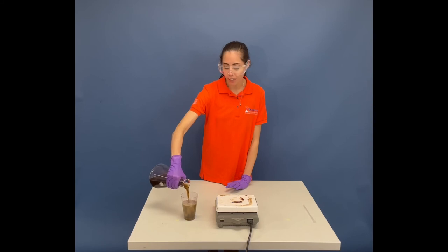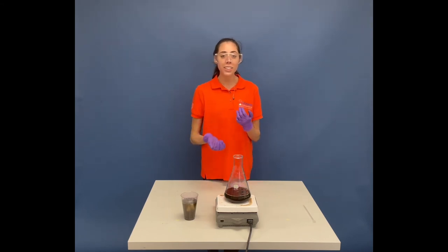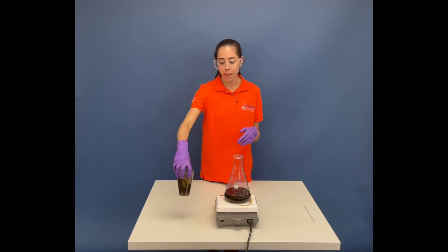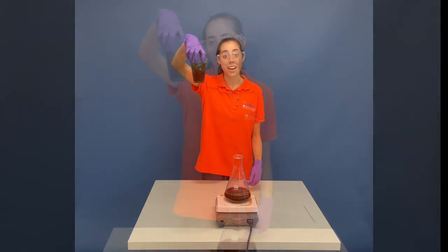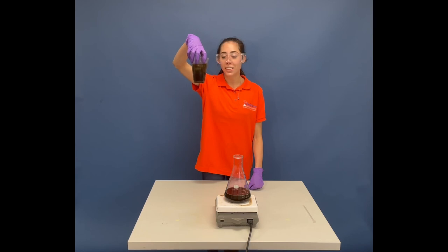As I pour it, it actually looks more like Coke. It fizzes up like it. So this is just a great reminder: don't drink anything or eat anything you see in lab, because even though this looks like a delicious beverage, it's not. It definitely contains something like hydrogen peroxide and a couple of acids. You don't want to drink something like this, even if it looks really refreshing.